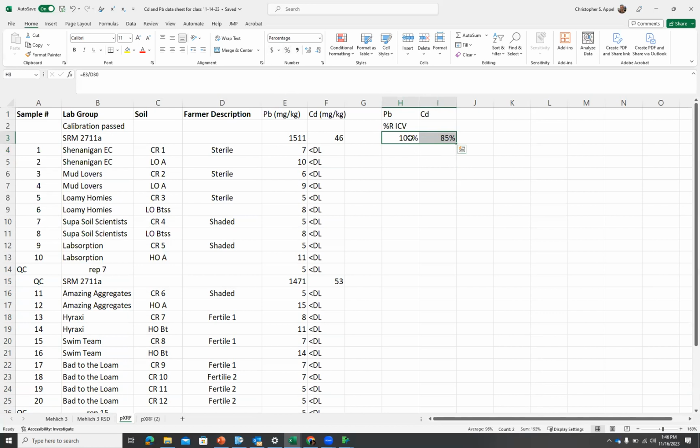And then what I'm going to do is I'm just going to copy that formula. But before I copy that formula, I am going to make it always go back to cell D30. Right? And you remember how we did that last time? You know that, right? $ sign in front of the letter and in front of the number. And I'll do that for both of them.